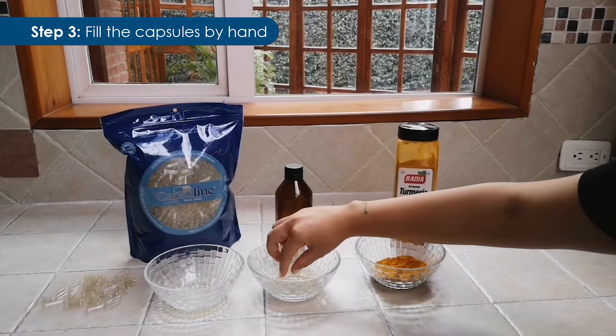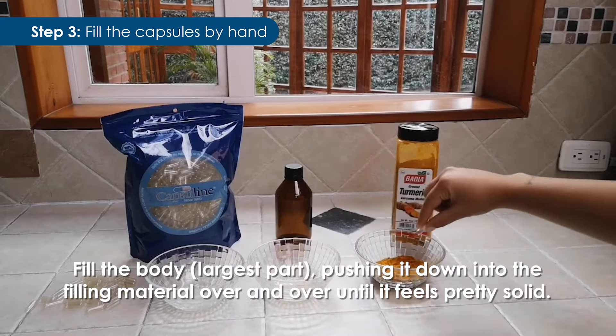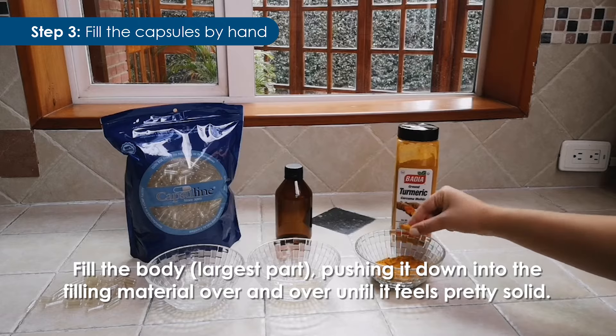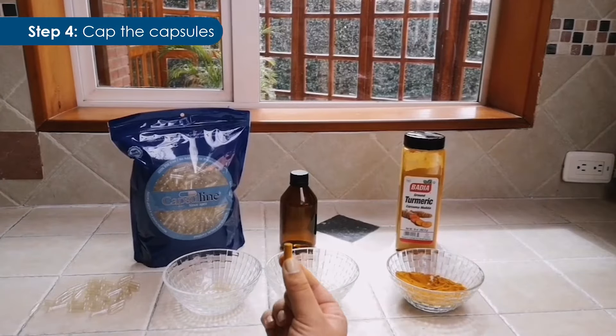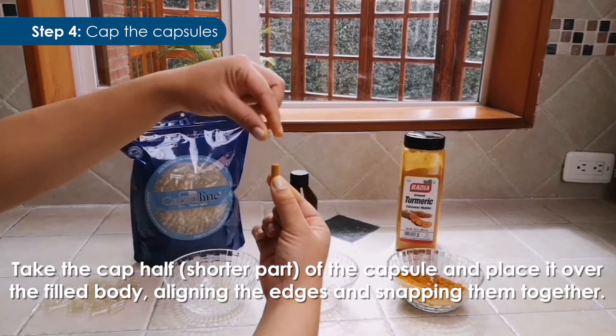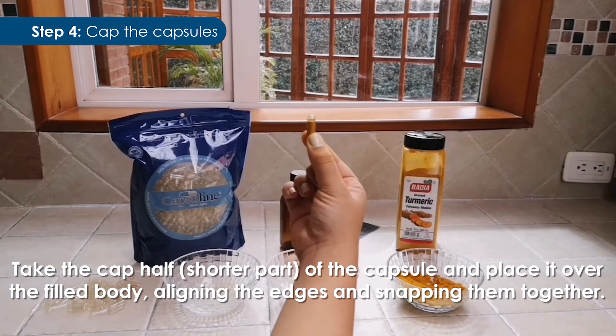Step 3: Fill the capsules by hand. Fill the body — the largest part — by pushing it down into the filling material over and over until it feels pretty solid. Step 4: Cap the capsules. Take the cap half — the shorter part — and place it over the filled body, aligning the edges and snapping them together.